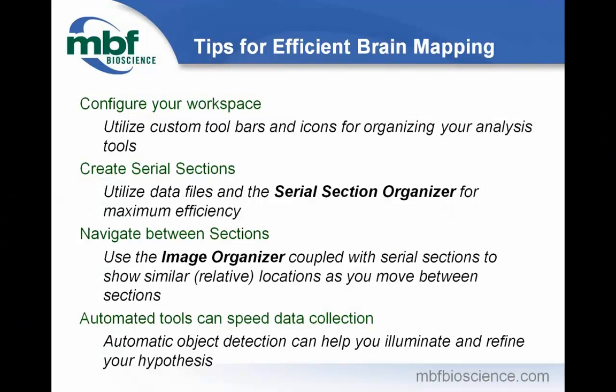So we've covered a lot of ground today. We've talked explicitly about brain mapping and that technique, and how you can use Neurolucida to generate that type of data. As with any experiment, the details and the level of accuracy that you require in order to prove your hypothesis is determined by you, and so you would create the model with that needed amount of accuracy.